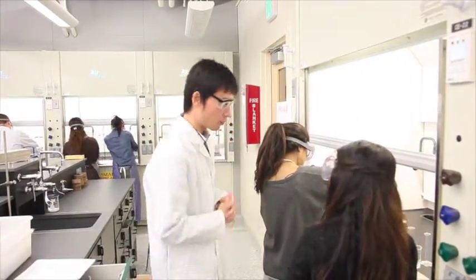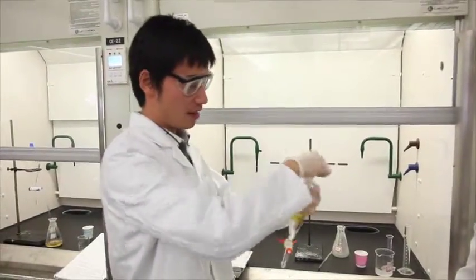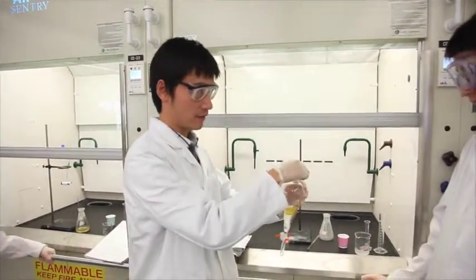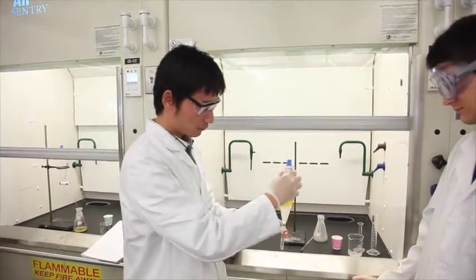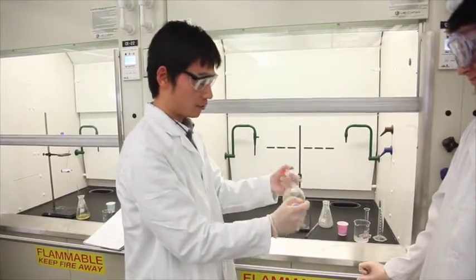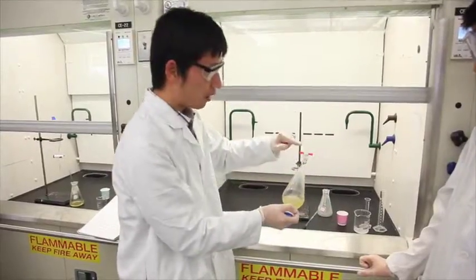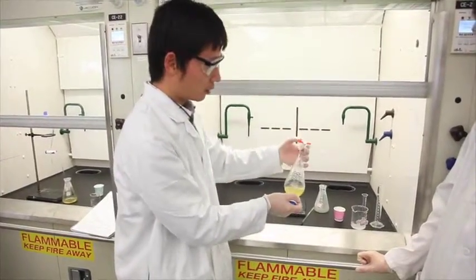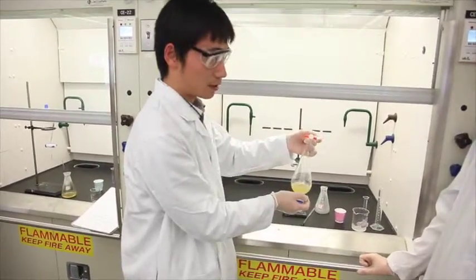Keep scratching. I'm going to use the separatory funnel. One thing is to make sure this cap is closed tight. And make sure the stopcock is closed. When you shake it, you need to use your left hand to hold the stopcock and the right hand to hold the top and shake like that. Always do not point the tip toward a student. And every time you shake it, you need to vent it a little bit to release the air inside.